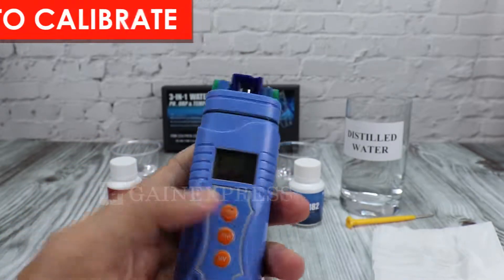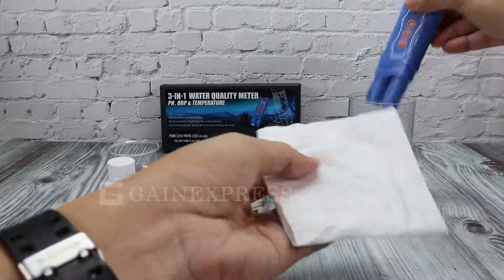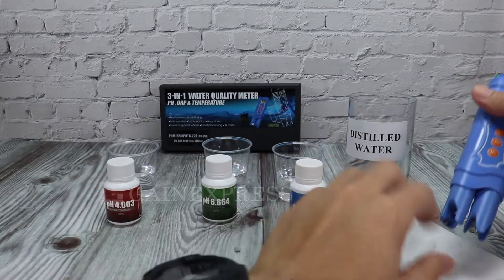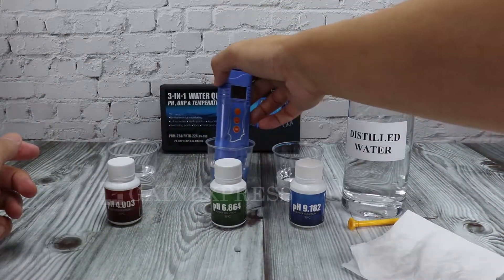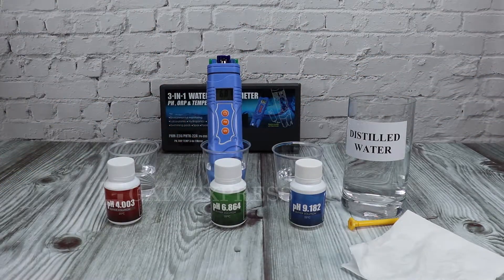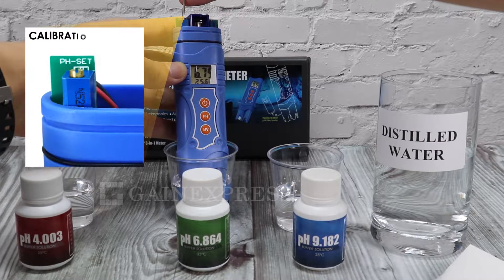To calibrate the meter, turn on the meter. Rinse with distilled water and gently wipe with clean tissue or cloth. Insert the electrodes into pH 6.86 buffer solution and wait until the reading becomes stable. Adjust the pH trimmer to match the 6.86 calibration solution.